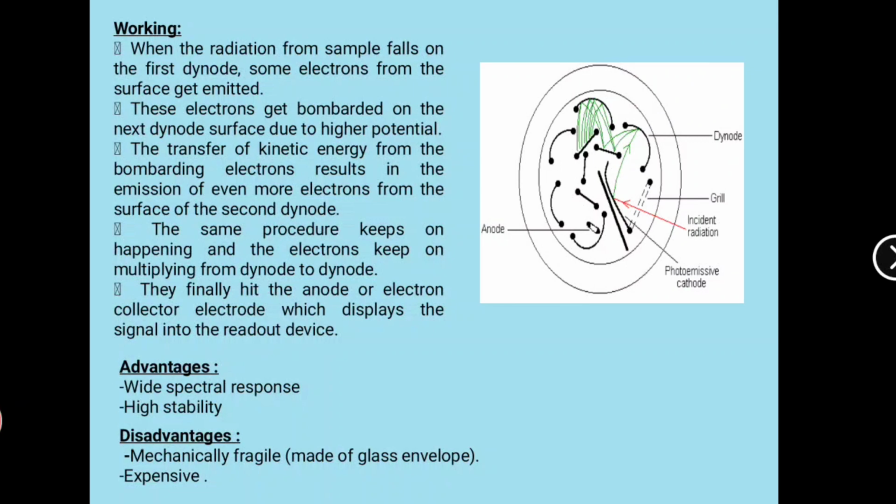Advantages. These produce a wide spectral response and are highly stable. Disadvantages. Mechanically fragile, made up of a glass envelope, and these are expensive.